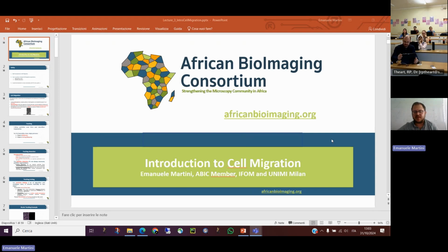And so today I will give you a talk about how you can study cell migration. It will be, of course, an introduction, but I think you will see most of the main topics and main stuff you can do to study cell migration.